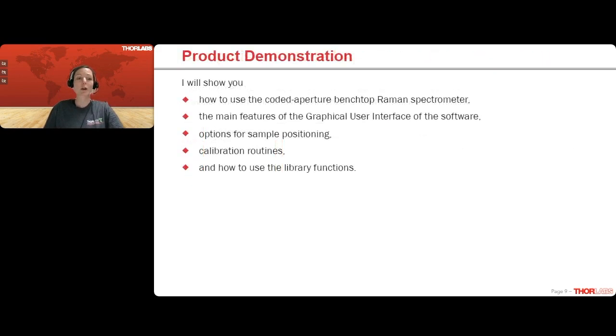So let's now come to the video demonstration that I pre-recorded, in which I will show you how to use the device, how to position samples, how the software looks and where to find the main features, how to use calibration routines, and how to use the library functions.